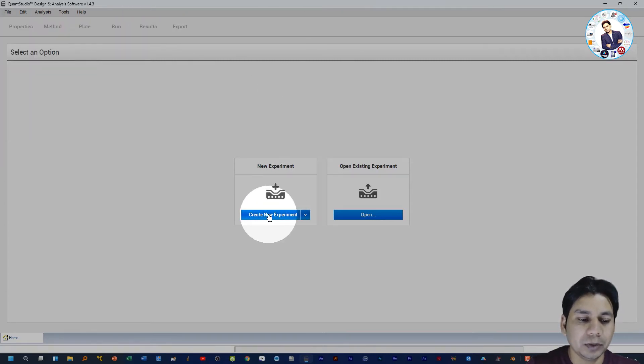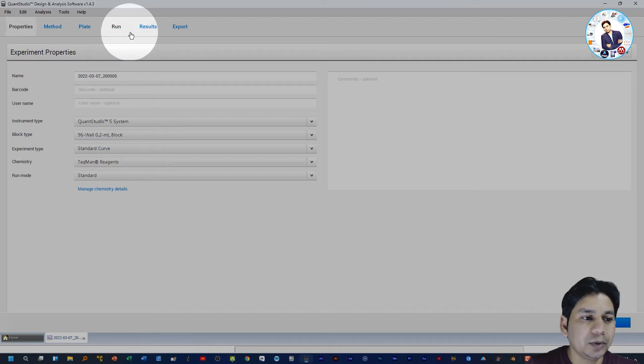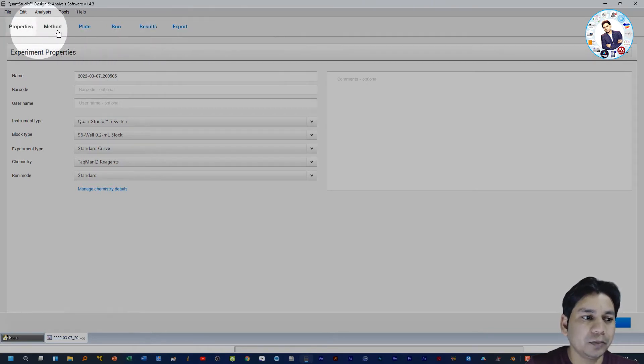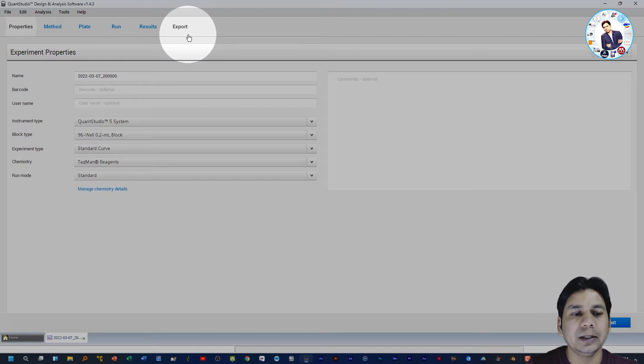Here you can see the steps involved for the experiment setup: Property, Method, Plate, Run, Results, and Export.